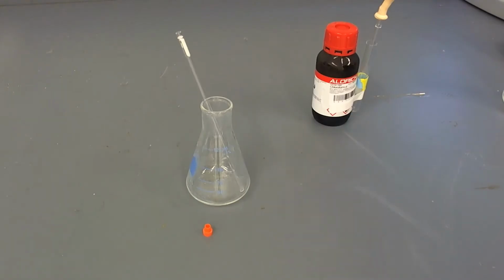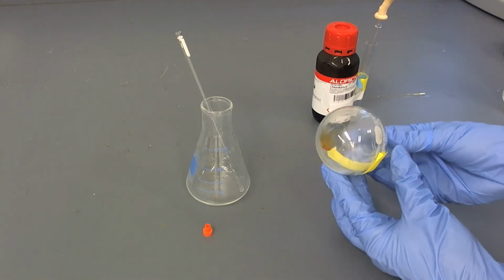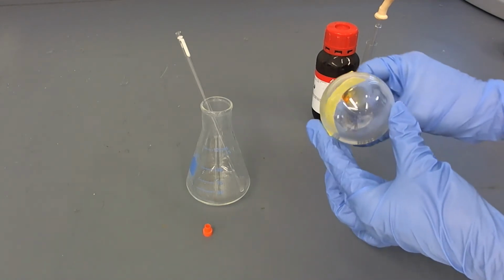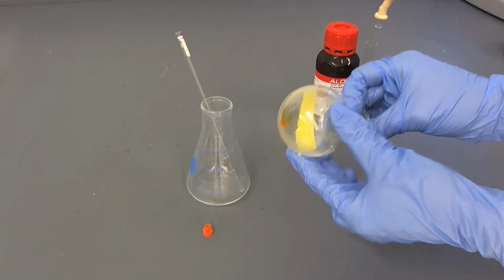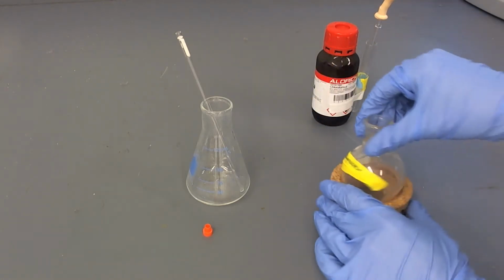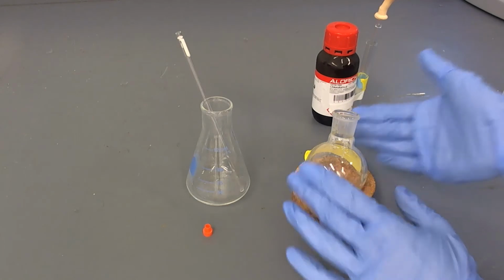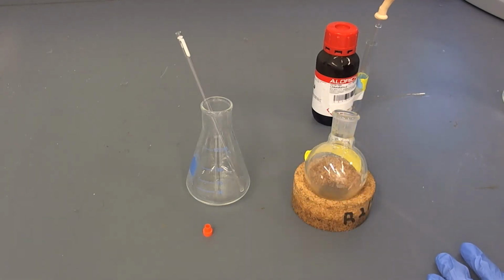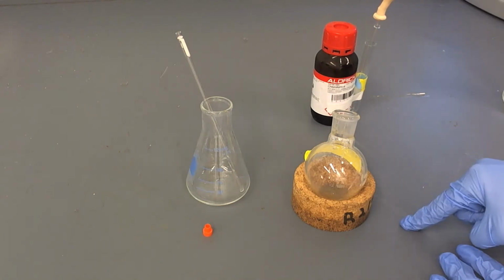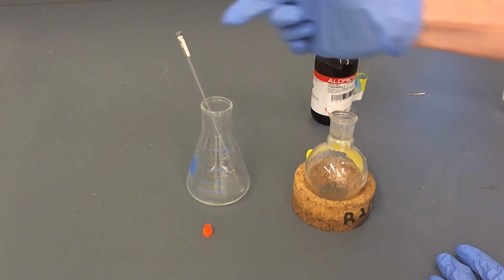Now let's look at sample preparation when we still have a liquid, but we don't have very much. We have concentrated our reaction mixture, and you can see there's some orange oily liquid in here, but not very much. Once I have the mass and all the other information from this sample, I'm going to add my NMR solvent directly to the flask, and then go from the flask to the tube.